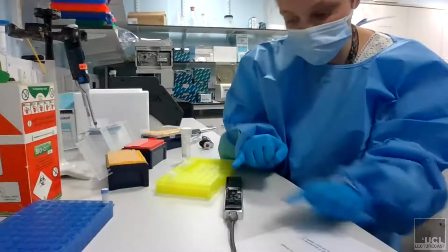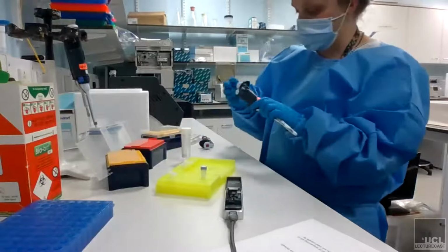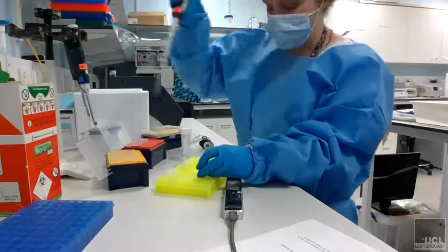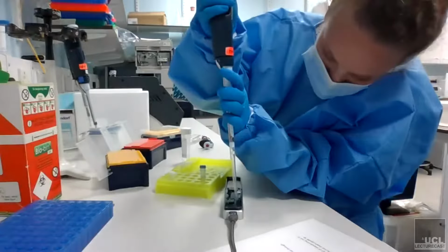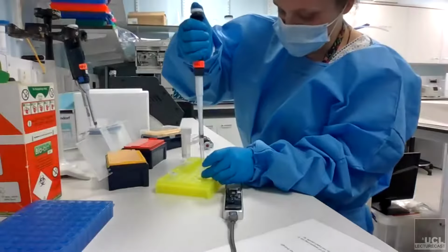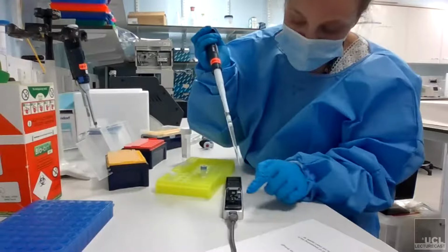So we've opened the spot-on hole, and now both of our ports are open. Now we're going to add another 200 microliters of our priming buffer. I'm going to do the same again because I'm really paranoid about bubbles. I'm going to make sure that we've got no air, so I'm going to suck up a little bit and then add 200 microliters again.